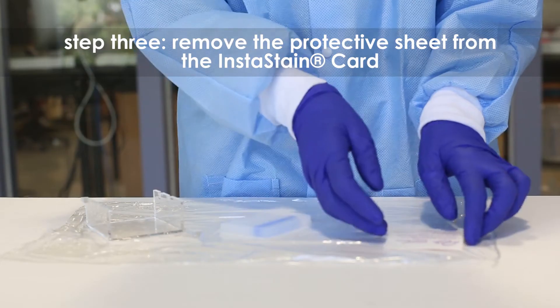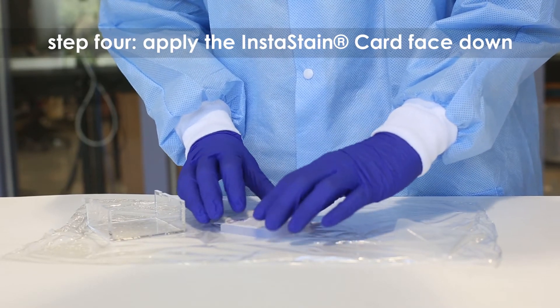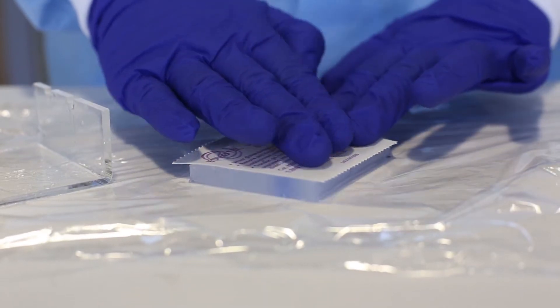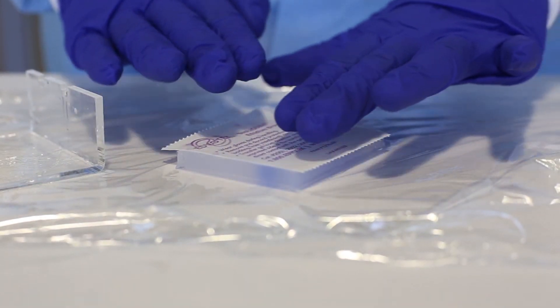Step 3: Wearing gloves, remove and discard the clear protective sheet from the instastain card. Step 4: Place the instastain ethidium bromide card on the gel face down. With a gloved hand, remove any air bubbles between the card and the gel by gently running your fingers over the entire surface.